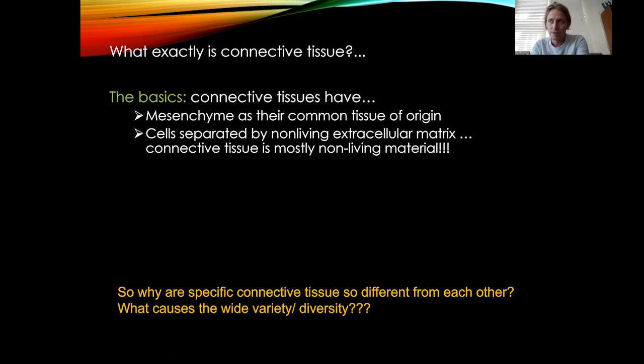So you could think of this kind of like if the cells of the connective tissue were spiders, they're living in this matrix or like a spider web that they created. So you're going to see this whole kind of spider web appearance of all these chemicals, fibers that we've created, and you're going to see the cells kind of just spread throughout that, living inside this extracellular matrix.